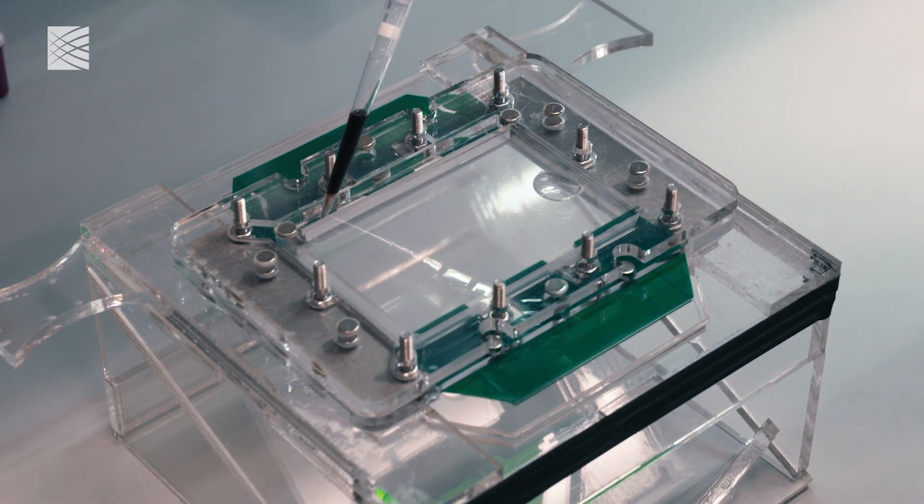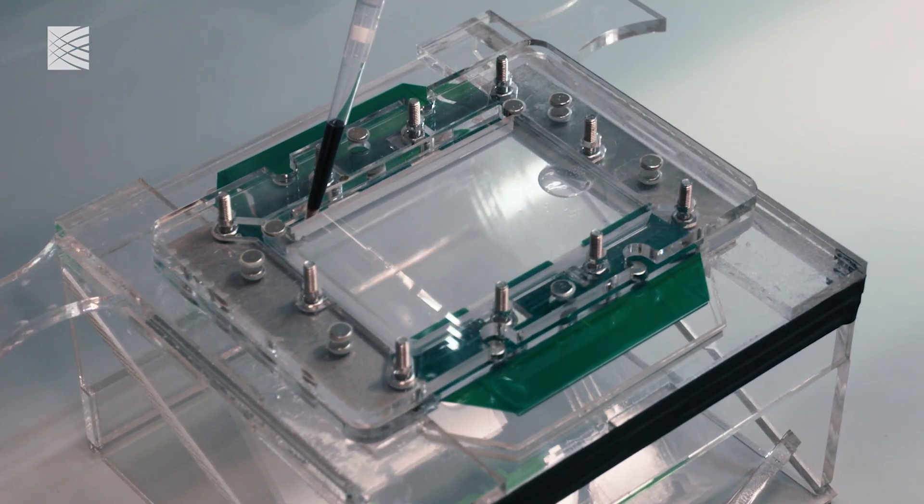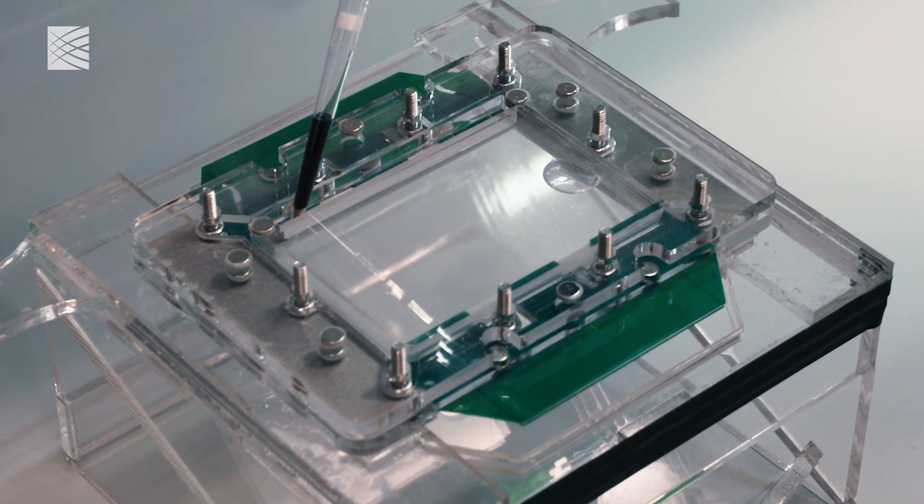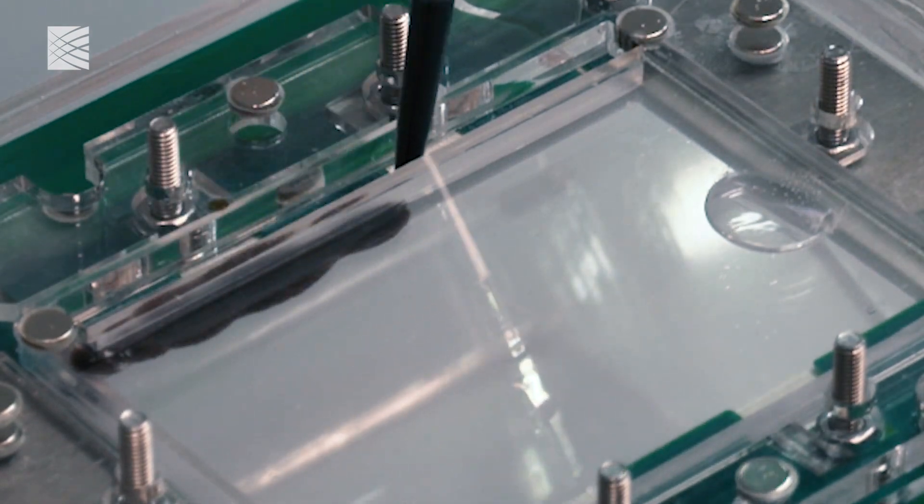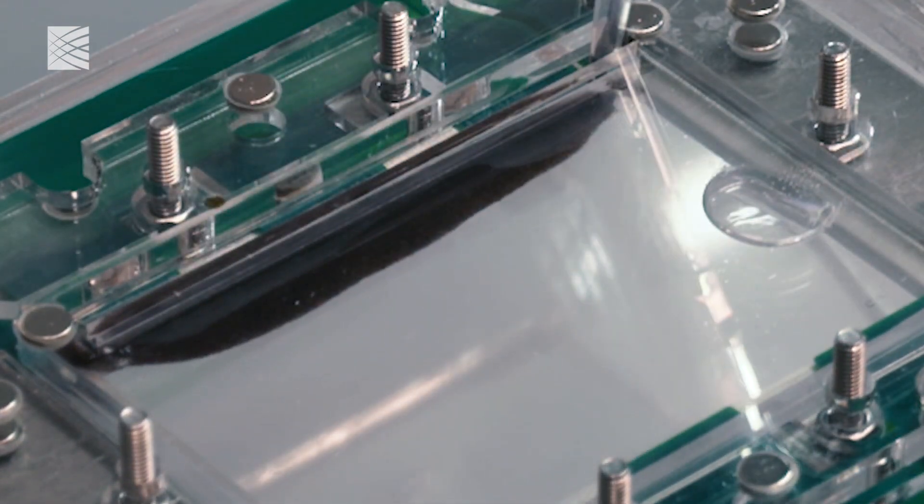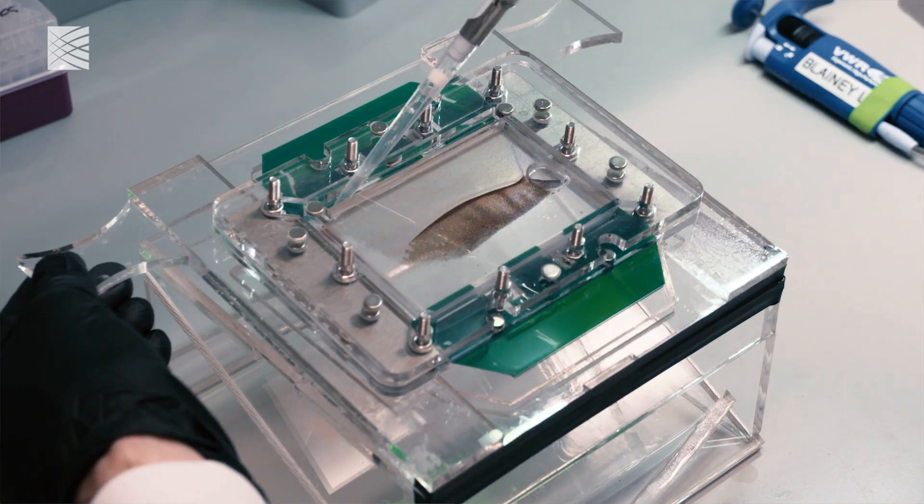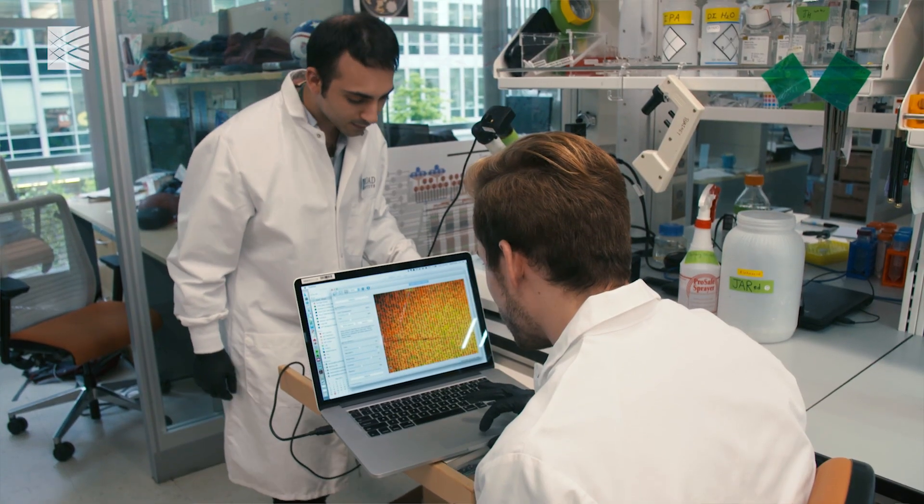We wanted to make this easier, so we designed this microwell array device that effectively tests about a thousand pairs of antibiotics and other drugs. We make these tiny droplets that each contain bacteria as well as a single antibiotic or a single drug, and then we load pairs of these droplets into each microwell.